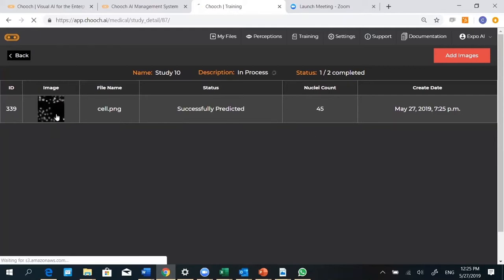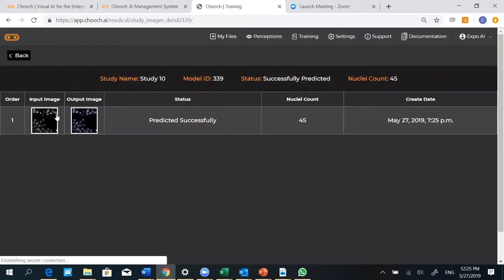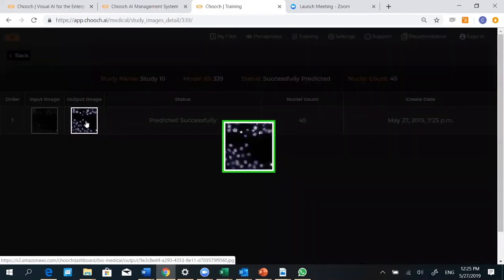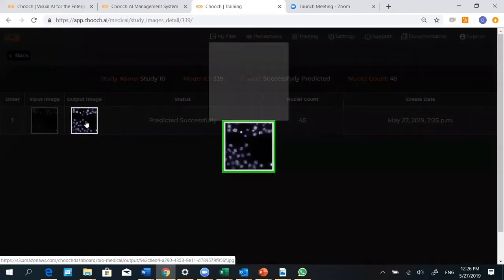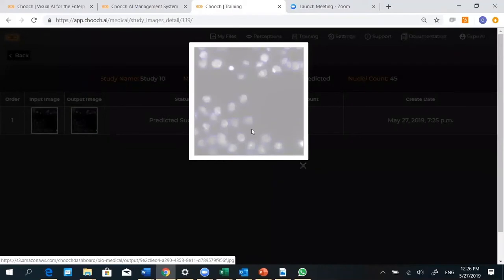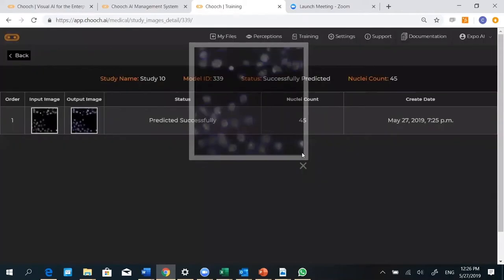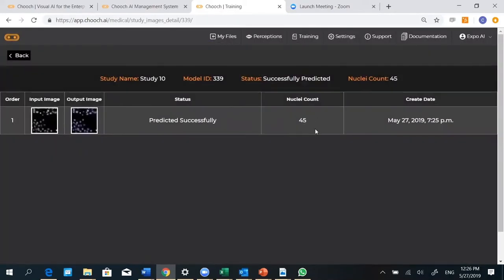Let's go to that image. Here you can see the original image, and here you can see the detected image with all the segmentation in there. These are the cells in that particular image, and here again is the count of that.